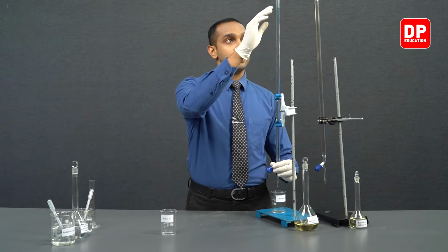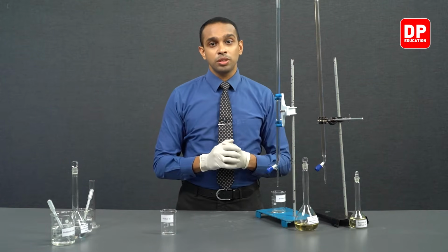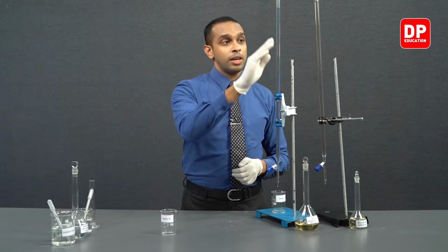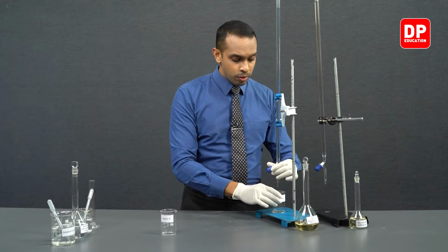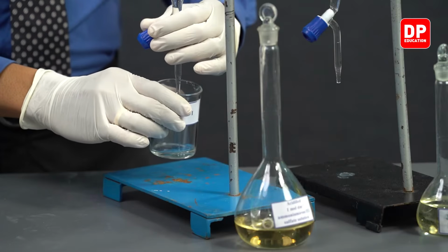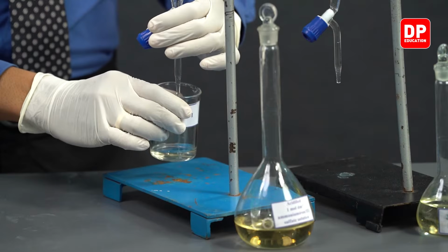So we have filled Fe3+ ion solution into this burette all the way to the 0 point. So we prepared our Fe3+ ion solution earlier on, and now we have filled it into this burette. So we will now use the burette to obtain exactly 25 cubic centimeters of this solution.